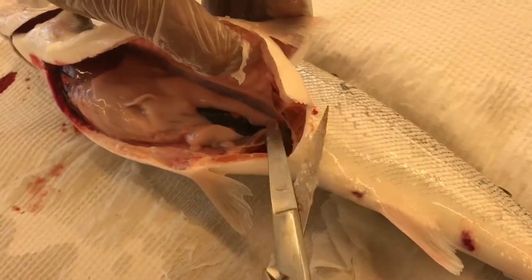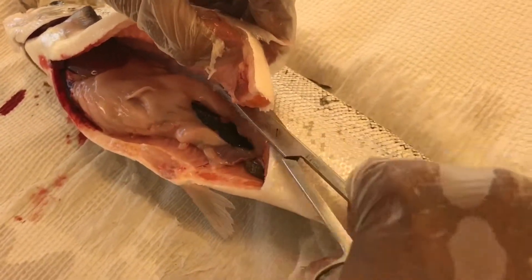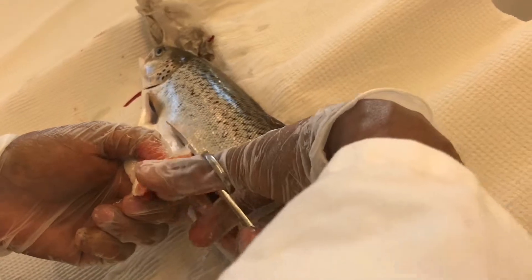To expose the internal organs properly, you can just remove a good portion of the body wall.